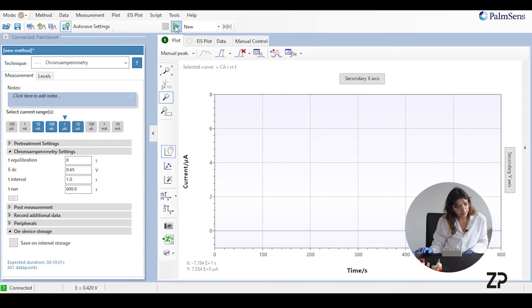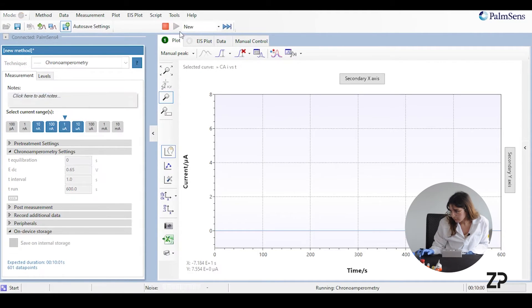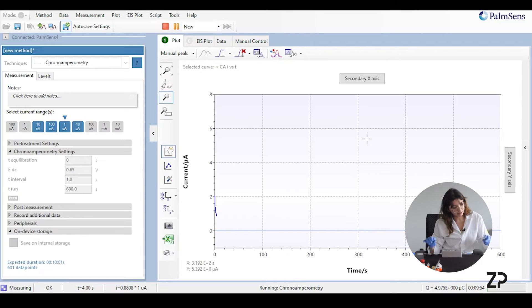Now that the lactate sensor is submerged, we press play and as you can see a basic chronoamperometric curve is showing. It normally takes about 100 to 300 seconds to stabilize, but for the sake of time we're going to add our lactic acid at 100 seconds.